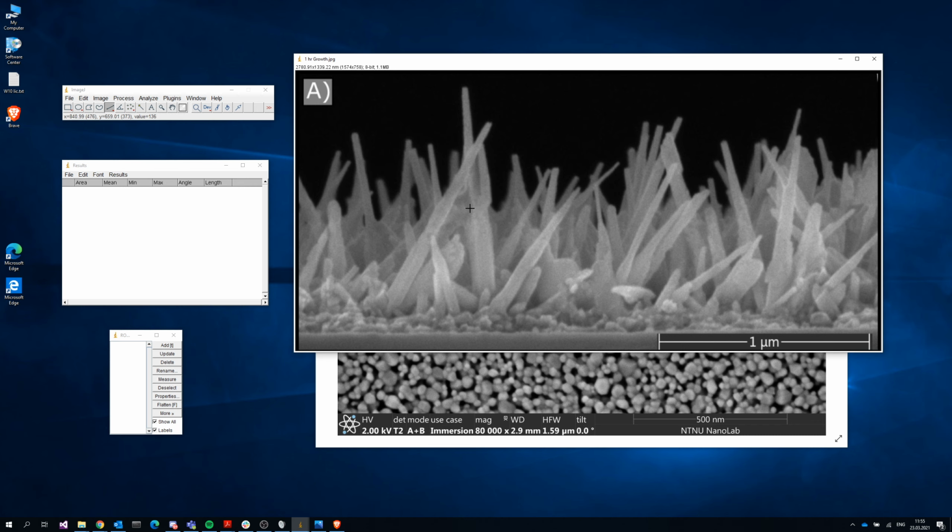It's something you could talk about in your reports, but pick a point along the nanowires and stick to it across the whole measurement. So let's just say somewhere halfway, right? Boom, add it. Let's go here, add it. And so on and so forth. Again, you have all these measurements, add them to your database, and so you have about 70 nanometers across, 30 nanometers across. Make sure to gather these measurements, put them in your spreadsheet, and generate your histograms. So that's about it. It's pretty simple.